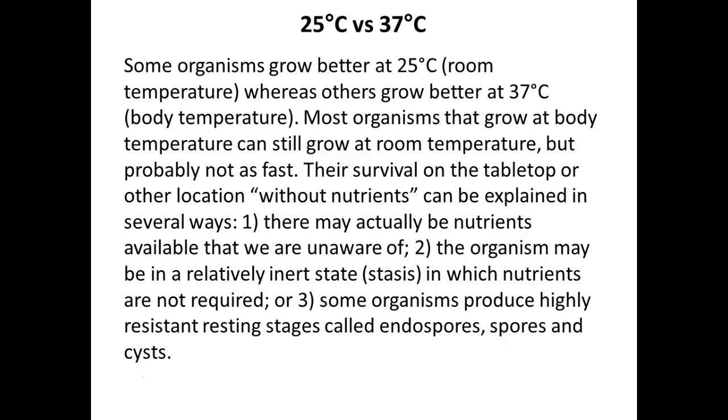So some organisms grow better at room temperature, where others, especially ones that come from us, are going to like 37. Most of them that grow at body temperature will also grow at room temperature, but not as fast as they would at 37, especially once you give them food. Hence why that fingertip one, right? Lots of growth, even though it was at a cooler temperature. It's also because there's lots of organisms and lots of food. We put them on food. Microorganisms are also very good. There's maybe a small amount of nutrients on those desktops, but they're also very good at starving. They're very good at going without for long periods of time. Much better than we are.